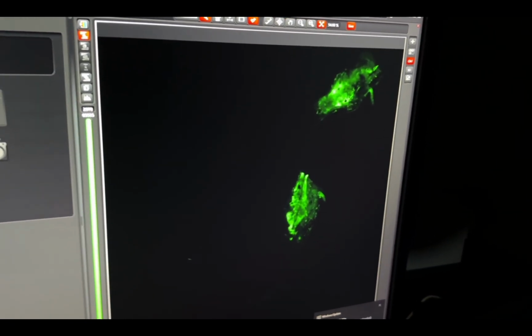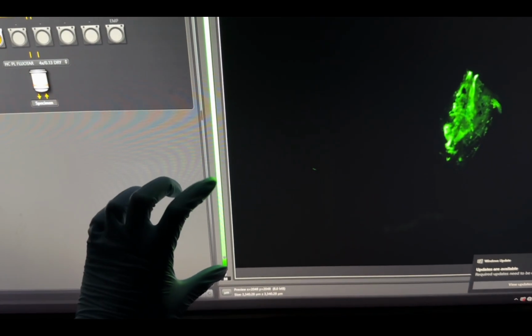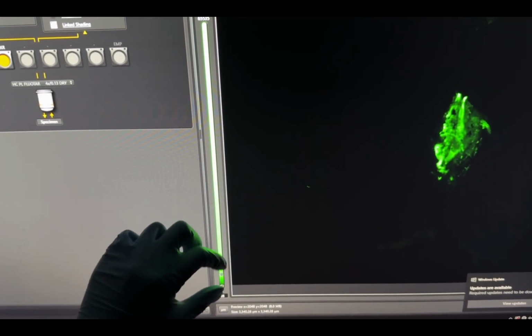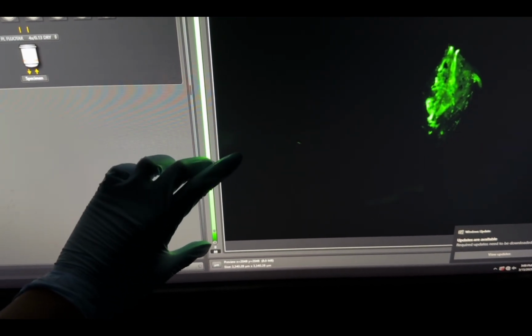So what is the rule of thumb? Where do we want this to be? Usually I use this as a guide, and we want this to be within kind of like a reasonable range around here-ish. You don't want it to be super low, you don't want it to be super high. Around here-ish I usually say is pretty good.